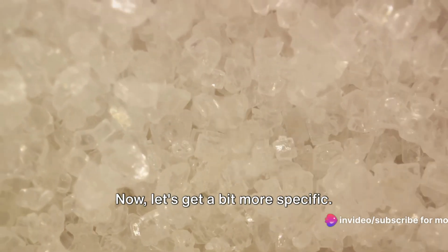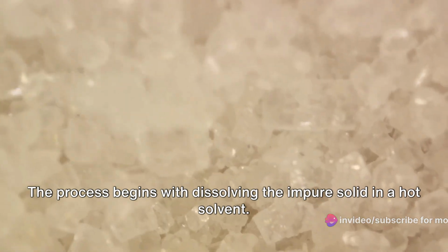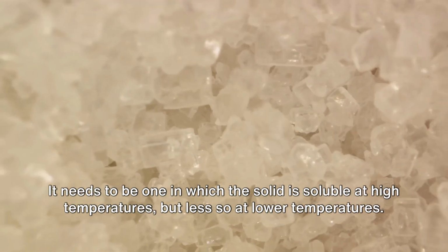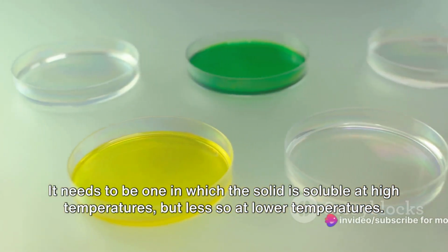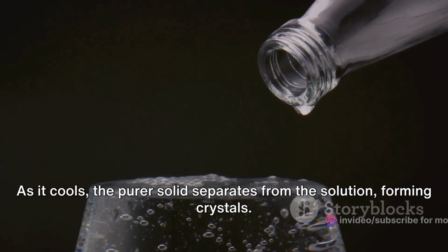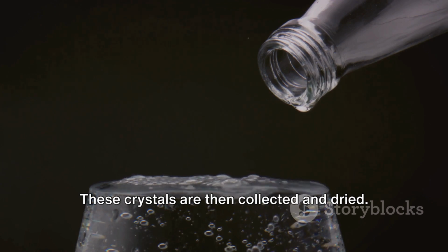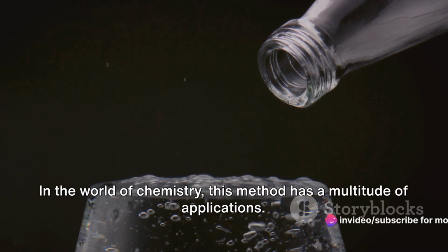Now let's get a bit more specific. The process begins with dissolving the impure solid in a hot solvent. The choice of solvent here is critical. It needs to be one in which the solid is soluble at high temperatures, but less so at lower temperatures. Once dissolved, the solution is then allowed to cool. As it cools, the purer solid separates from the solution, forming crystals. These crystals are then collected and dried. Voila! You have a purified solid.